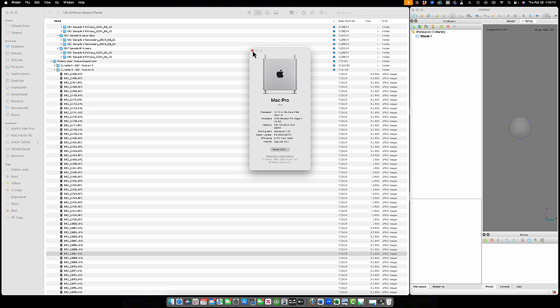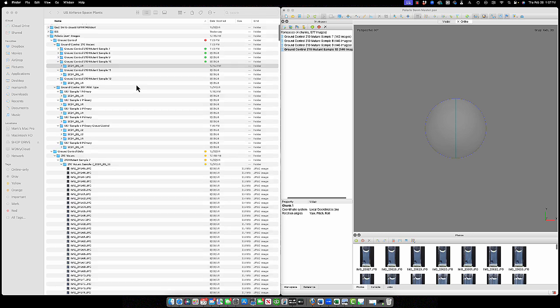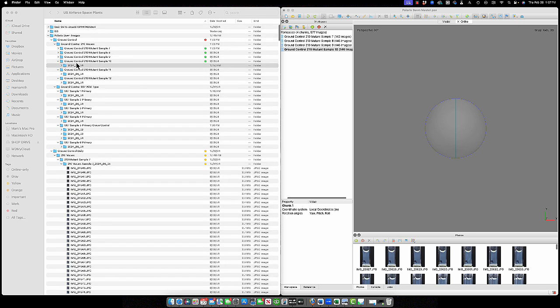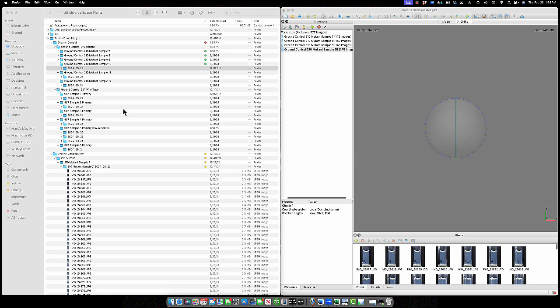But there's going to be some times when I'll step away while the computer is processing, and then I'll come back. What I'm going to be doing when I transfer all the data is I'm really just going to have the day 1 image, and I'm going to 3D model those. And then the day 14, so 2 weeks later, that image data is also going to be imported. So as I create a chunk, I'll pull in all the images associated with that chunk.